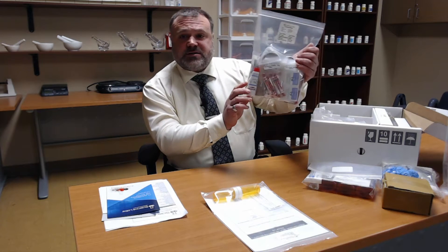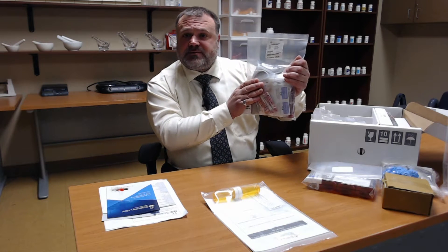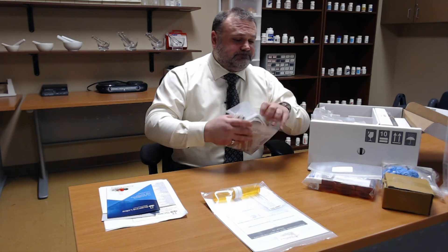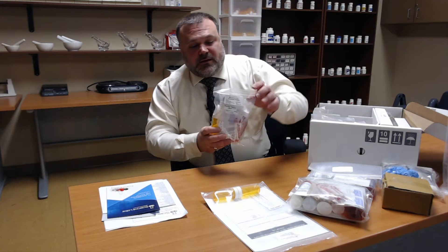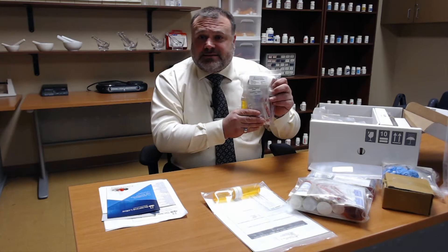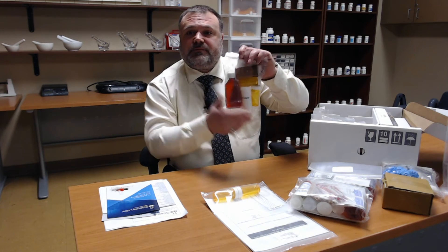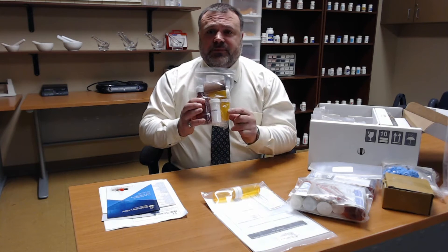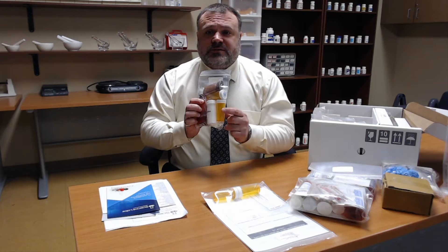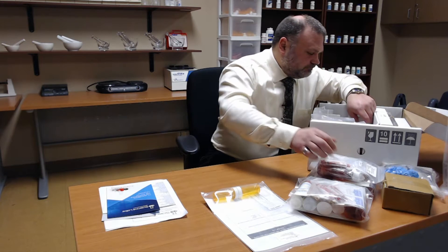The compounding kit also has your ointment base, your cream base, alcohol prep pads, and some salt tablets that you'll be utilizing. This is an equipment practice lab. We have more placebo tablets, more Smarties, some prescription vials including an ointment and cream vial, the prescription dispensing vial, and another liquid vial.